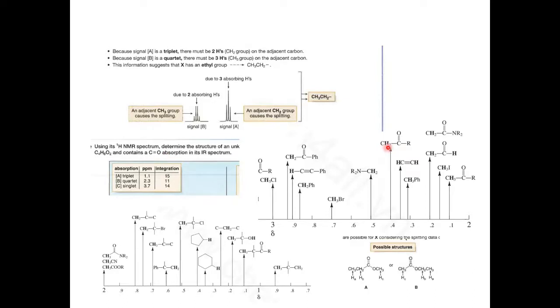So this CH2 attached to the CO, right, the carbonyl group. Now this CH2 is attached to CH3, which is coming here about this type of system, 1.1. So CH3 of this 1.1. So this CH2 is attached to CH3 and we have OCH3.